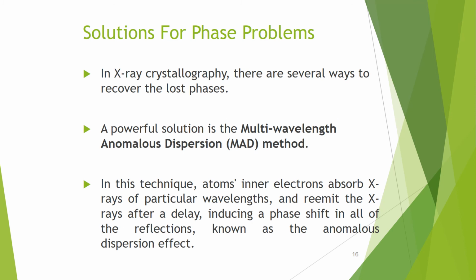Solution for the phase problem. In X-ray crystallography, there are several ways to recover the lost phases. One powerful solution is the multiple wavelength anomalous dispersion, which is known as the MAD method. MAD, multiple wavelength anomalous dispersion method.